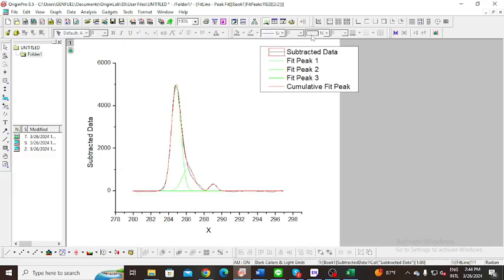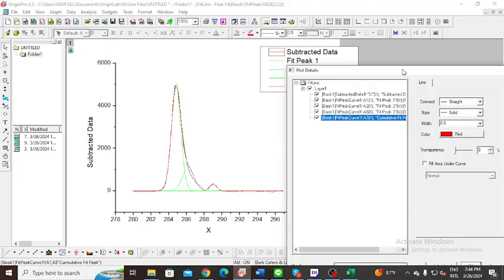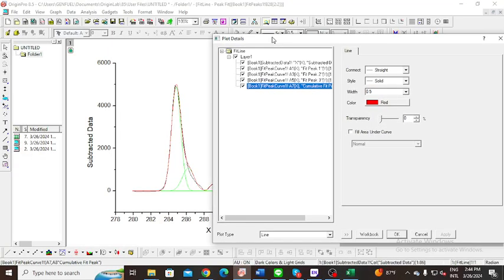Okay, so if the figure is not really clear, just double click on the picture, and you can see the red one is the accumulative of the three peaks. Usually I make it just like the art, but actually usually just try it to see what fits best, to make it more obvious, more bold, so it can be more obvious.